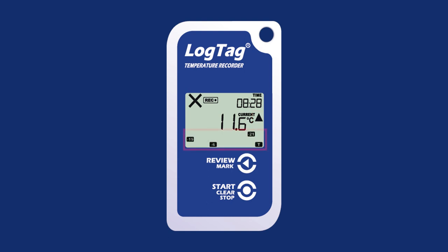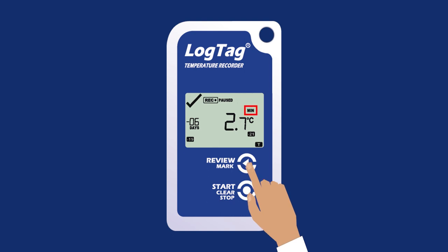Once the logger has been logging for several days, the days where alarm excursions occurred will display at the bottom of the screen. Press the Review Mark button to enter the statistical review. The maximum statistic will display first. Press the Review Mark button to view the minimum statistic.